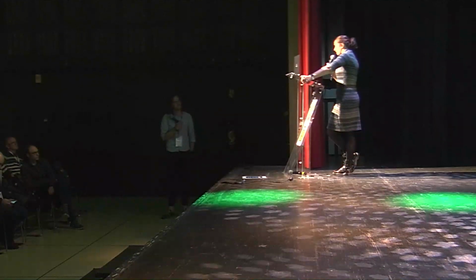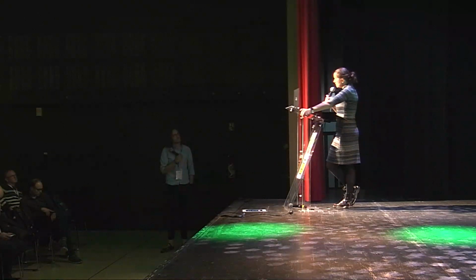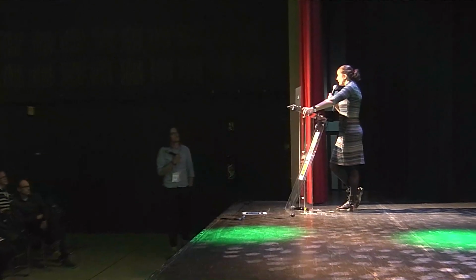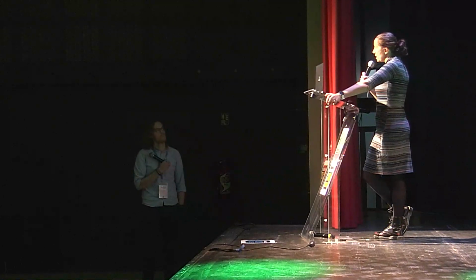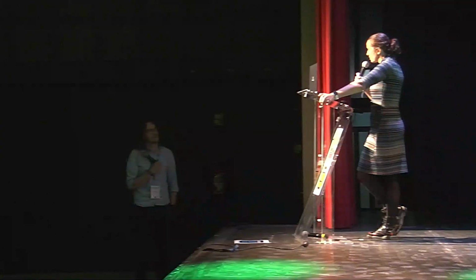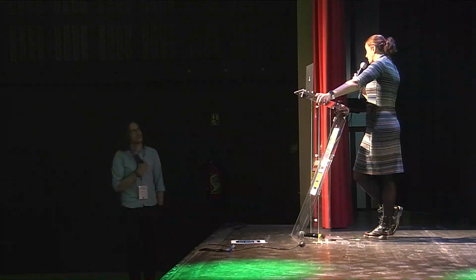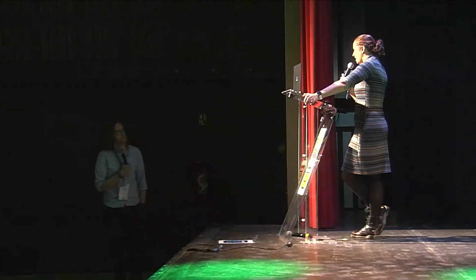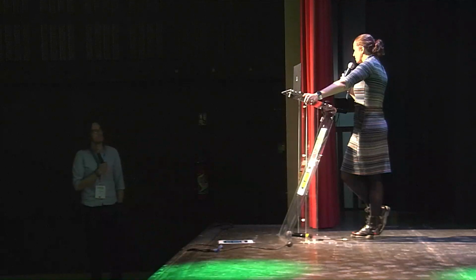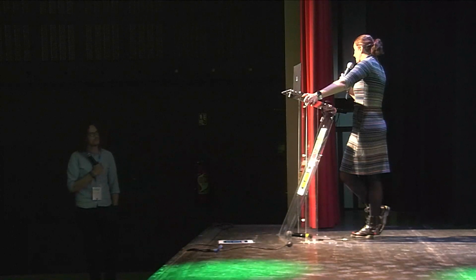So we make a form in the resin print, and then the post-print, post-cure step, I should say, is spin coating with a slightly different resin, and that allows us to produce the smooth finish that's required to minimise the scatter of light. So you spin coat on the printed elements? Yes, it's highly scattering without the spin coat. Once the spin coat goes on, it looks like a lens. And they're hard, you can drop them, it's fine. They're as hard as any other lens.